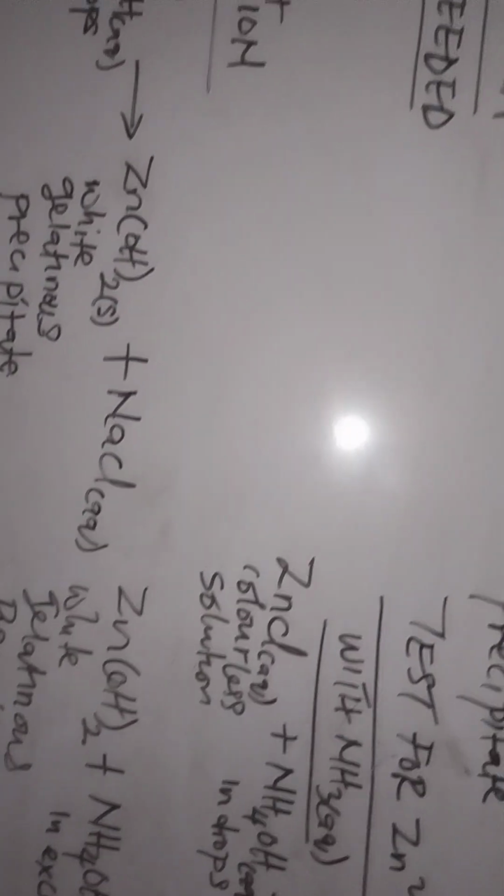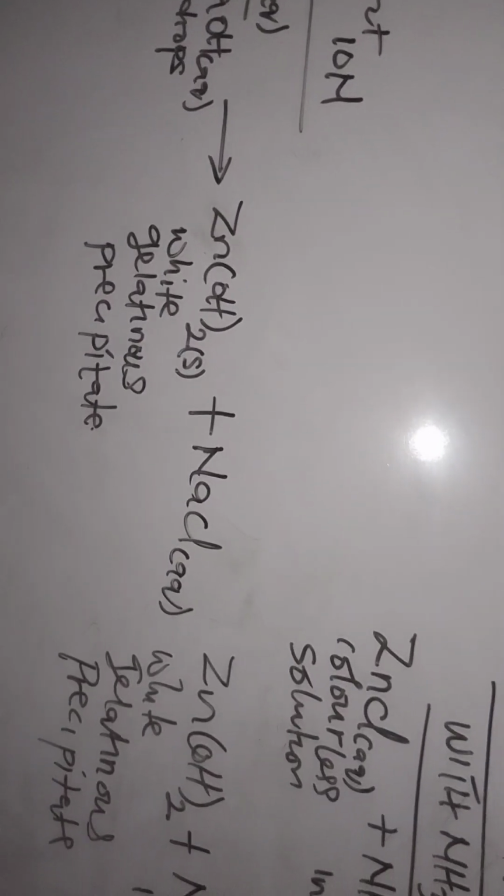So now let us look at how to test for chloride ion. To test for chloride ion inside zinc 2 chloride, in the case of test for chloride ion, you need the following reagents. Tests for chloride ion.